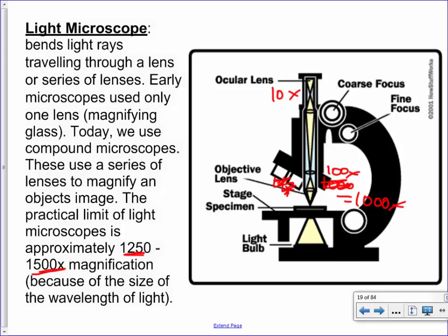So usually use the coarse adjustment knob at first to kind of get things in the right place. And then for the little details, you use the little bitty one. I'm changing this little bitty one right here. I don't think you can even see the thing moving all that much, because it's just moving fractions of a millimeter.